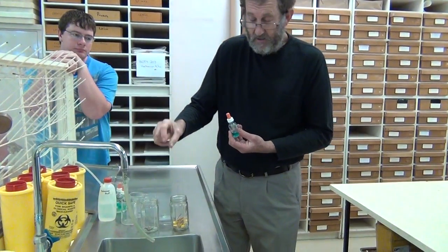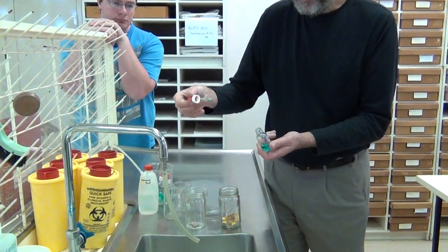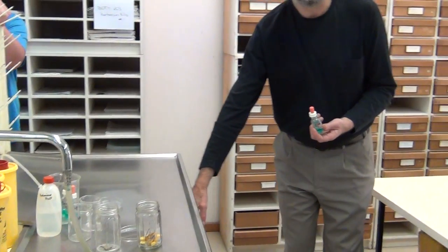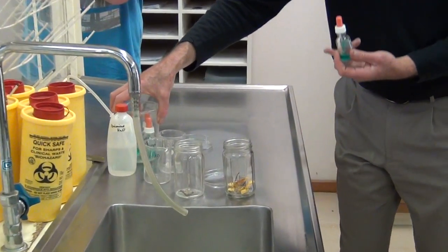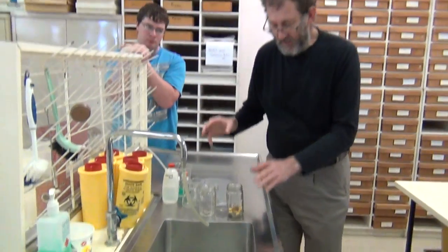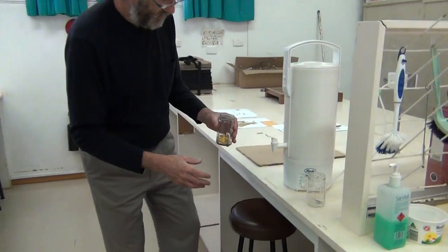If you have your little piece of paper with the collector's name and number, put them in the right containers now. Then add a drop of detergent — just one drop. At home, one drop of detergent is more than enough; even diluted detergent would be fine. That's just to break the water surface tension so that the water actually rehydrates the material.